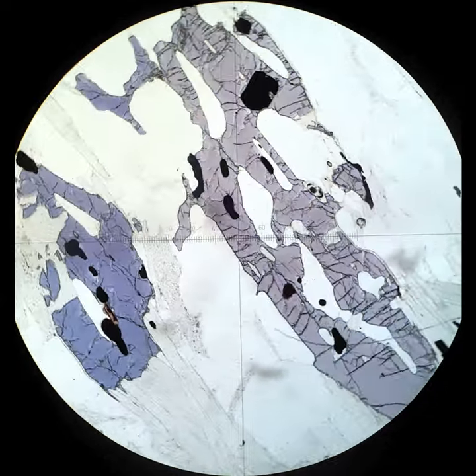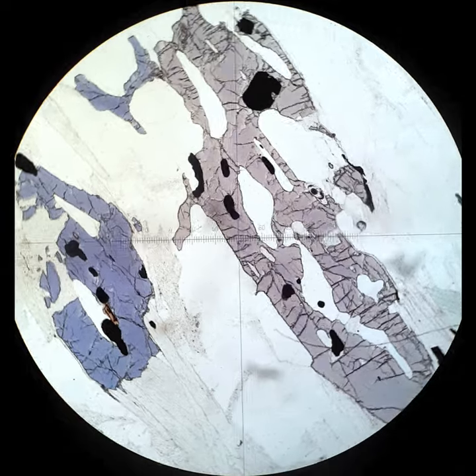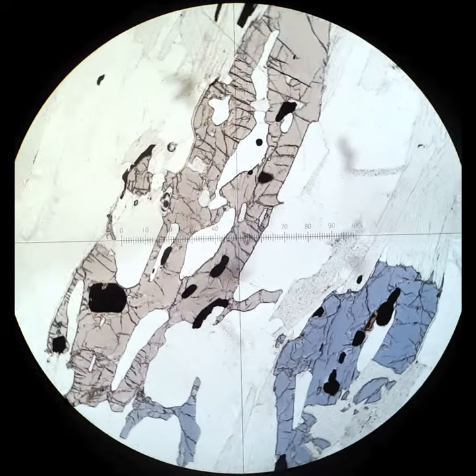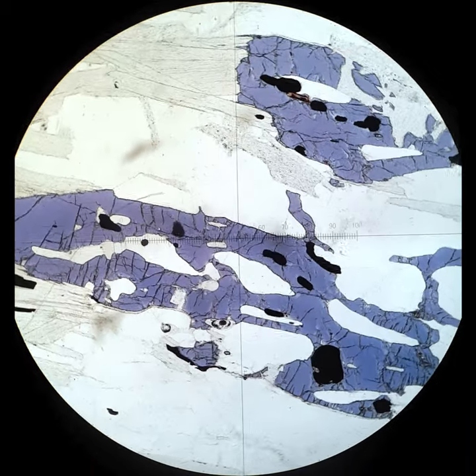The mineral we've been watching is called yoderite, and it shows these changes in color and color intensity depending on orientation. So it's one example of pleochroism.